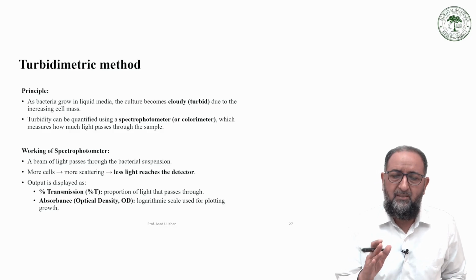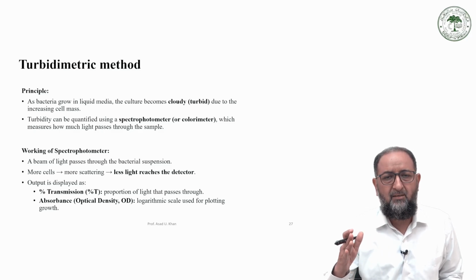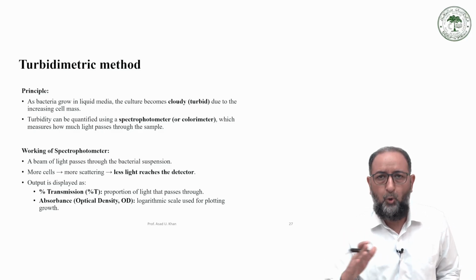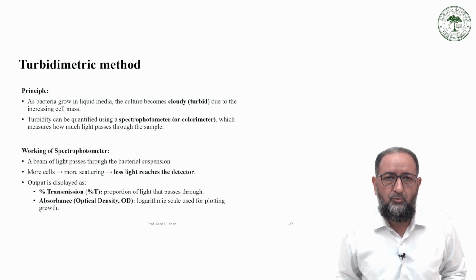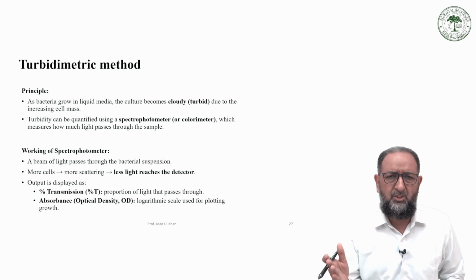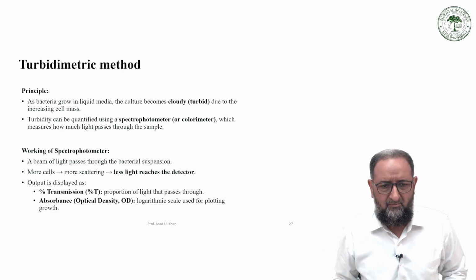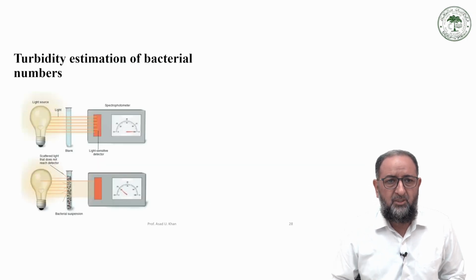So here a color-based method is not used. It is not the absorption at a certain color or by chromophores of a compound, no. Just like in protein estimation or DNA estimation, where we need to use chromophores, and the wavelength may be 280, 260, 290, but here we are using the scattering effect. So we use 600 nanometer OD. So this is the instrument method.